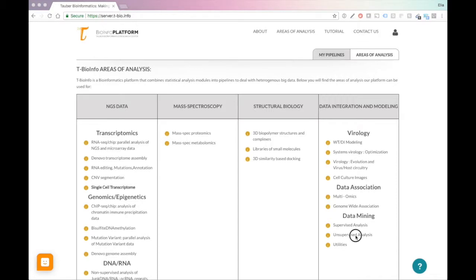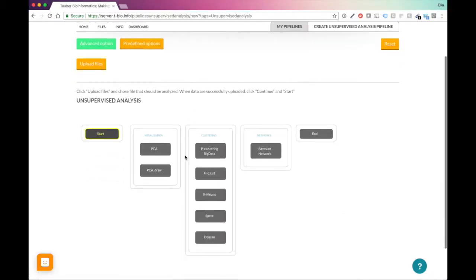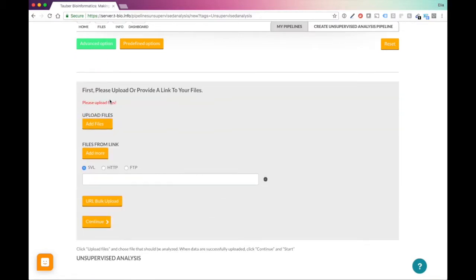Now what we can do is go under unsupervised analysis. What you'll see here is that you have these two options, PCA and PCA Draw.